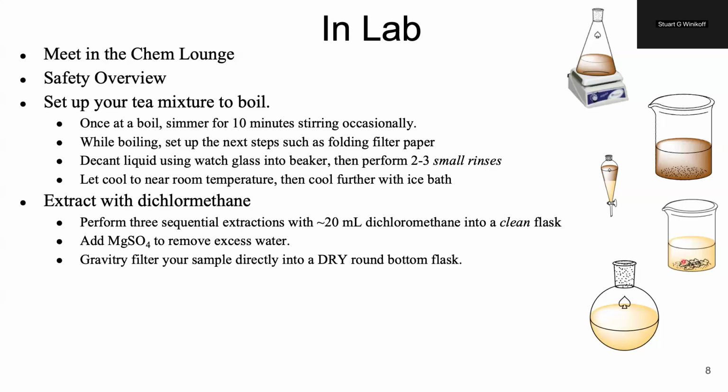Then you're going to want to go ahead and gravity filter your sample directly into a dry round bottom flask. Then you're going to cork that flask and bring it over to me so I can go ahead and rotovap it down.